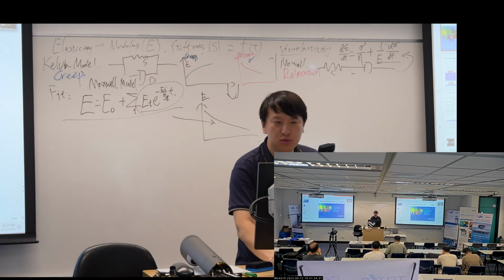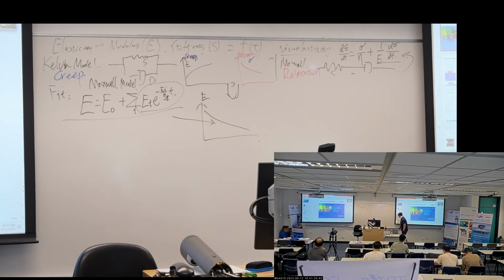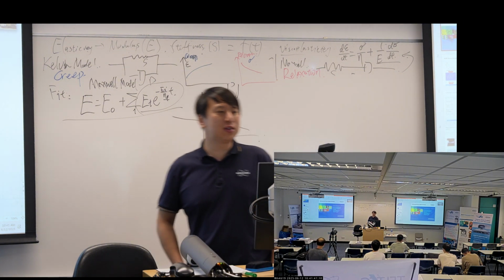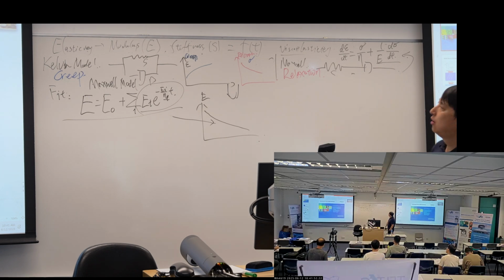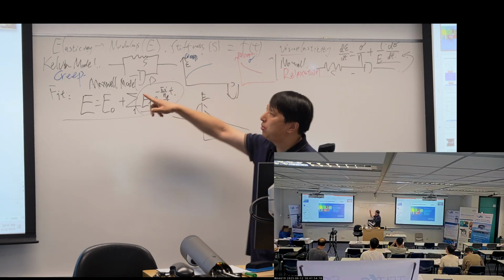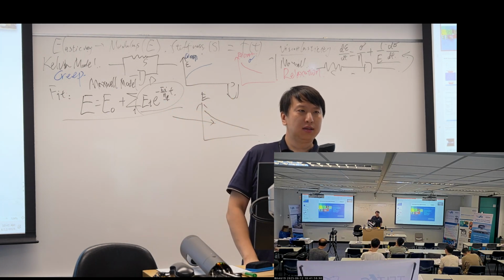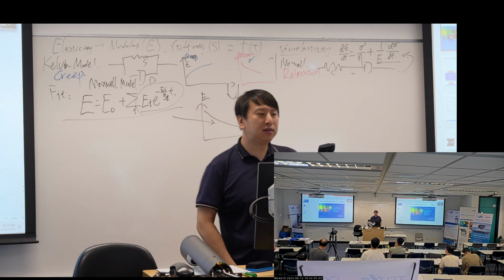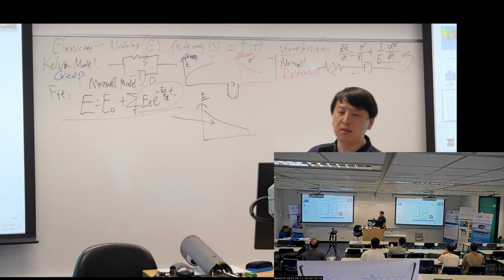Okay, let's go to the so-called advanced force spectroscopy. This is used when we do force curves and try to conduct classic creep and relaxation on the AFM. And so the slide is about this three, and at the beginning of this slide, I list out something.